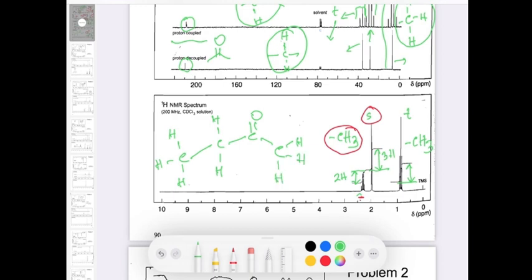So now you can see the peak like this. This is 1st carbon, this is 2nd carbon, this is 3rd carbon, this is 4th carbon. So that 1st carbon has 3 hydrogens, that is a methyl group, and that is shielded. So that is the very first one. Okay, and the second group has 2 hydrogens, and that is like here, this one. And the third group doesn't have any proton, and the fourth group has a proton but it has no neighbor, so that is the 4th one.